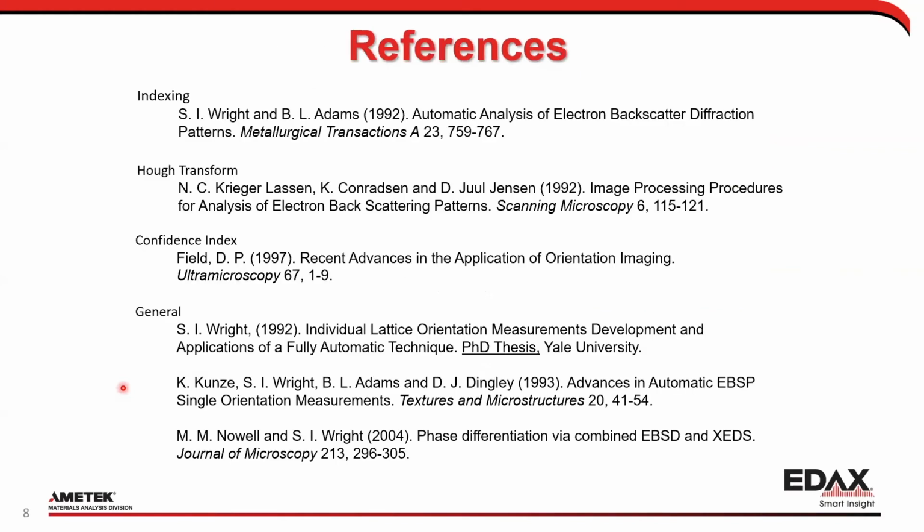Some references from this talk. A lot of this goes back to the early days of EBSD because they figured it out and it works very well. Some of this stuff is changing with some new methods of indexing, but the basics of indexing was really kind of figured out by Dr. Stuart Wright in his PhD at Yale back in the day.